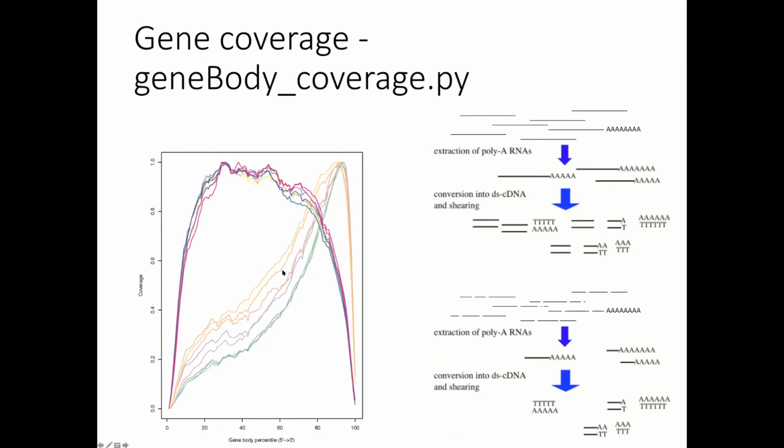So when you're doing RNA analysis, if all your samples are looking like this, it doesn't necessarily have to be that bad that they are degraded. The big problem comes when half of the samples are looking like this and half of the samples are looking like this. Because then you are going to get different representations of the number of reads per gene.